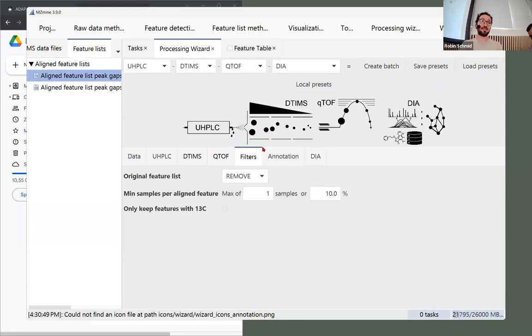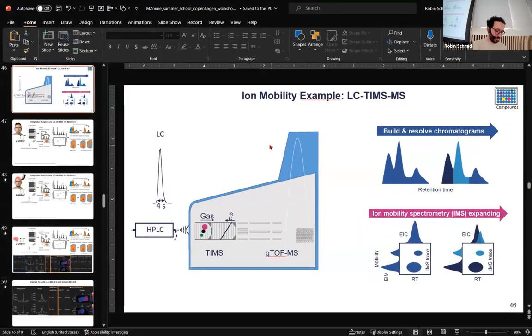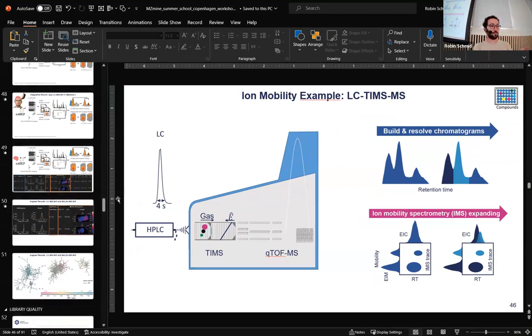Yeah, so just one thing, because we still have time, we also plan to show it, and we hope for having that time. We already mentioned it a couple of times, is the generation of reference data. We're also going to share all those slides. So if someone feels like they're going to miss out, there's going to be the recording, and there's also going to be the slides that you can follow along.